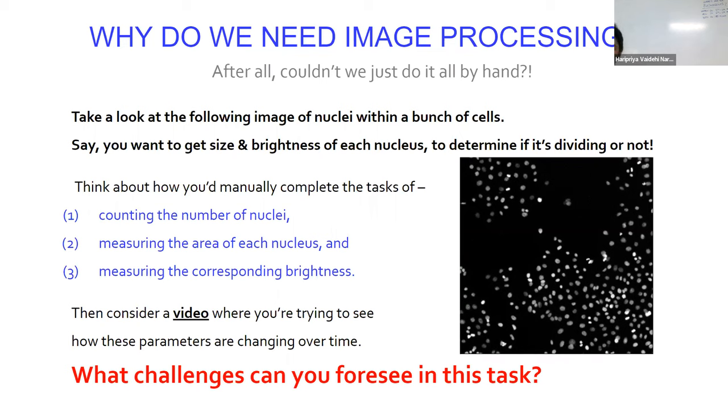And you can actually see some interesting features. Some of these nuclei are brighter than others, so you can see a certain amount of unevenness in the staining. Some of the nuclei, like this one, have really bright spots within a darkish background. And in other structures, you can see something like this, which is two bright condensed spots. That's actually the chromatin segregating to divide the cells, like pulling the chromosomes apart.